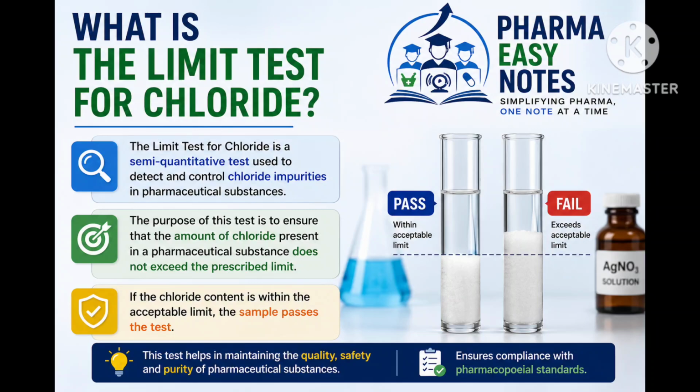So let's get started. What is the limit test for chloride? The limit test for chloride is a semi-quantitative test used to detect and control chloride impurities in pharmaceutical substances. The purpose of this test is to ensure that the amount of chloride present in a pharmaceutical substance does not exceed the prescribed limit. If the chloride content is within the acceptable limit, the sample passes the test.